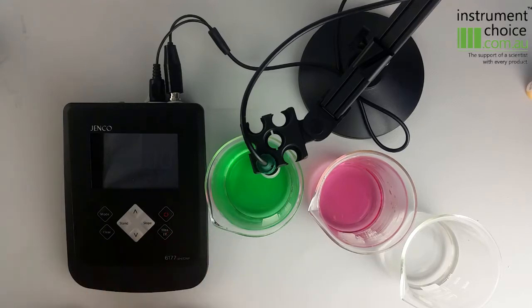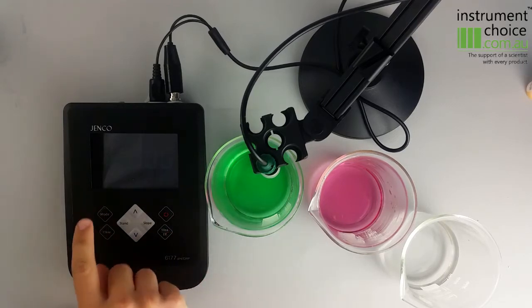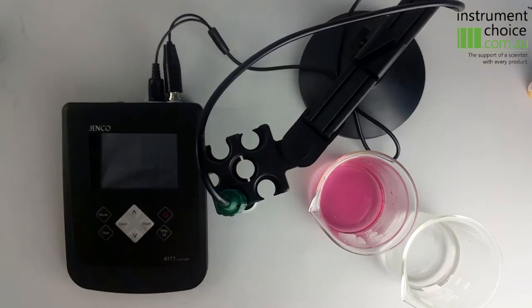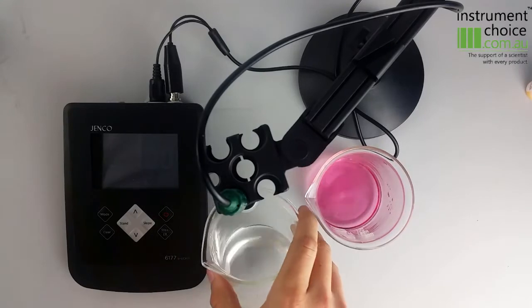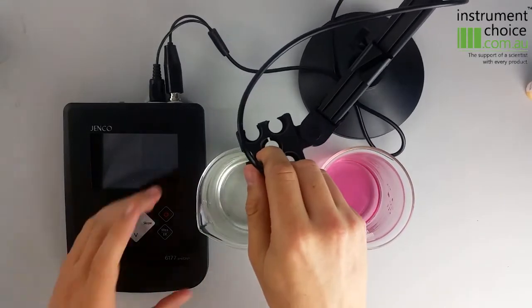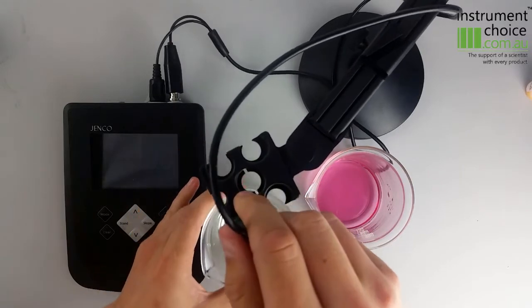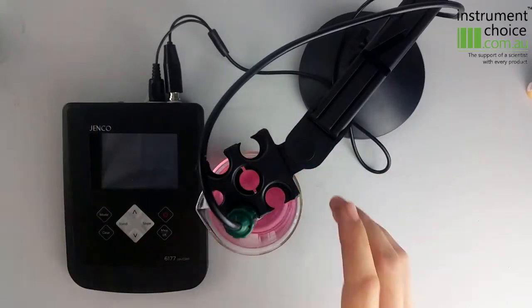Now it's locked that value in. What we'll do next is the 4 value, so we'll pull it out of the pH 7 solution, get rid of that, bring in some distilled water and rinse our electrode quickly, then put it into our pH 4 solution.